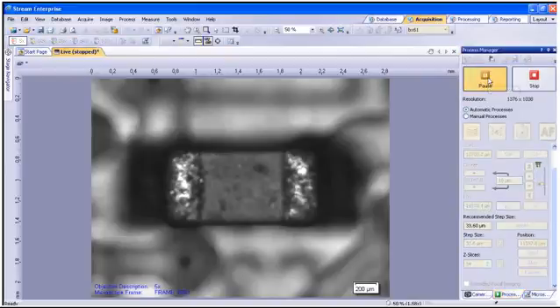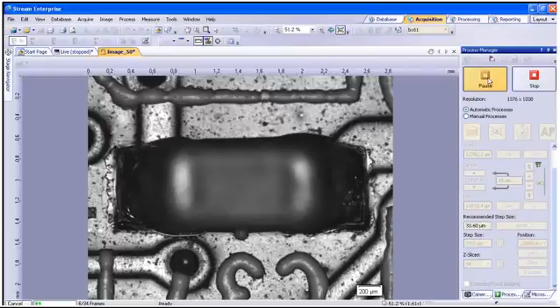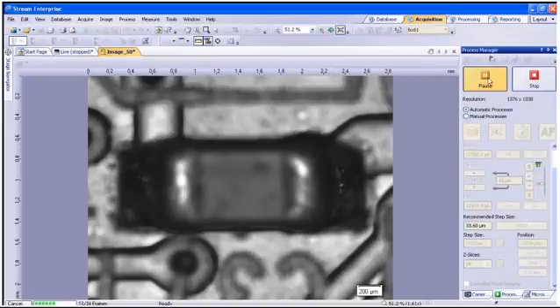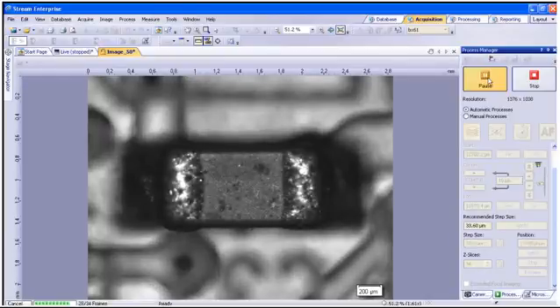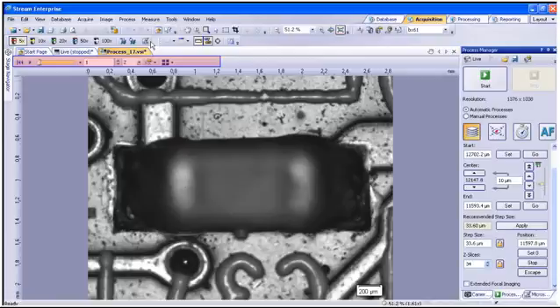The process will now be automated and perform all of the image captures required to generate the all-in-focused image, or EFI. You can watch the progress of the automation at the bottom of the image window, or cancel it at any time. Now that the process is completed, you will see the title bar of the image change to allow you to view all 34 slices of focus points.